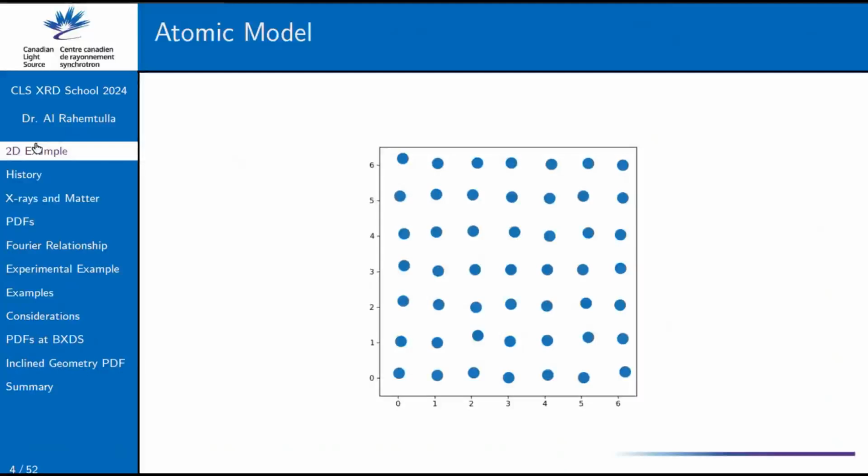So if we're in the PXRD regime or the XRD regime, we could probably break this down quickly into a nice little unit cell and describe it fully. But let's, for the sake of argument, pretend that we don't know anything about Bravais lattices, or this isn't really crystalline, and we still want to find a way to describe it. Probably the easiest thing to do for us as scientists is, rather than trying to break something down to a 2D or 3D model, reduce it into one dimension.